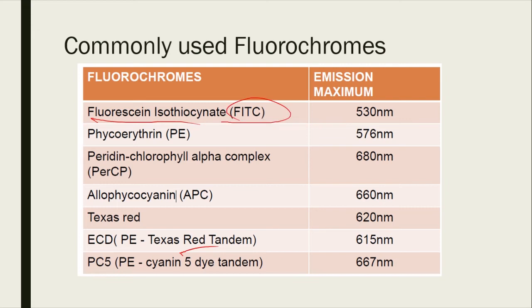You can have two different colors, right? If you give two different fluorochromes or fluorescent molecules to a different type of antibody. So you have antibody A, antibody B here, and if one is linked to a red signal and one is linked to a blue signal, then you can have different colors. So it could be generating even more information than just the forward and side scattering.